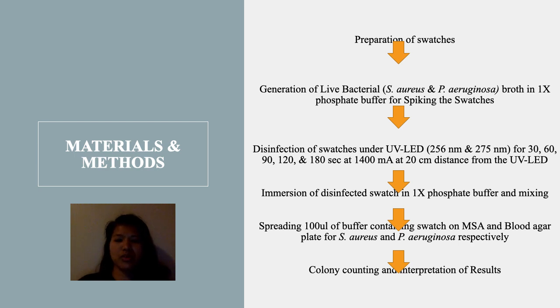After doing this, we incubated them at room temperature for 6 days, and after 6 days, we did colony count using the dark field colony counter.